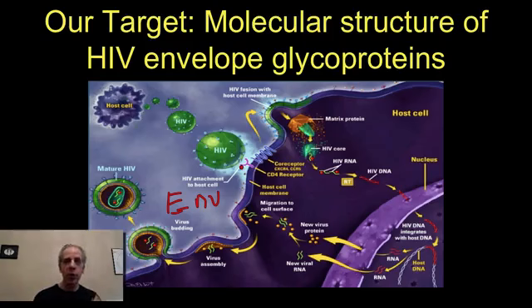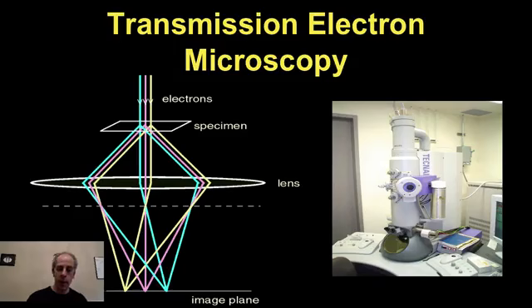Now we are at those small scales, remember. And then what we need to use is not light. We won't be able with light to get to that scale. We use electrons. And here is a diagram. Now, once again, you are used to basically light. So light comes, reflects off objects like me, and then regular cameras, like the video camera that is recording right now, capture the reflection. In transmission electron microscopy, basically we have the specimen.